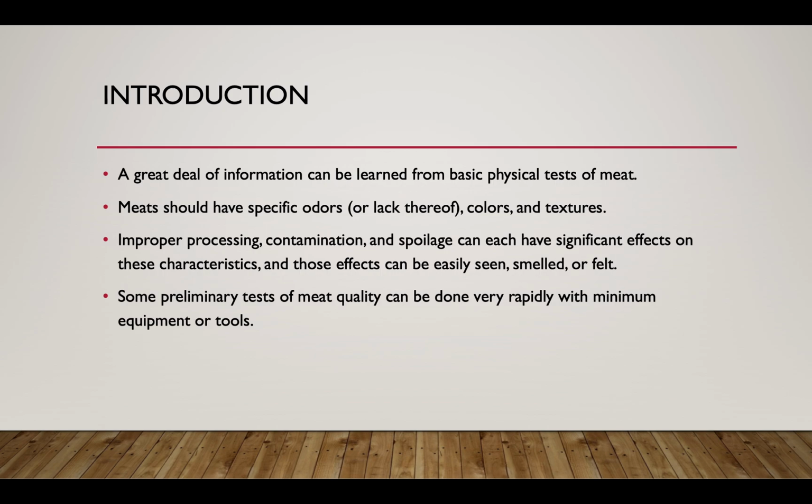Improper processing, contamination, and spoilage each can have significant effect on these characteristics. And those effects can be easily seen, smelled, or felt. Some preliminary tests of meat quality can be done very rapidly with minimum equipment and tools required.